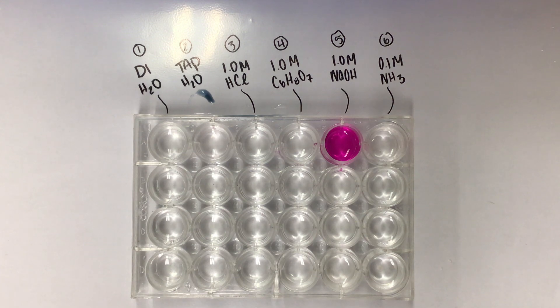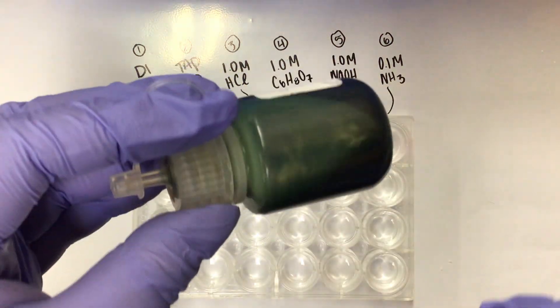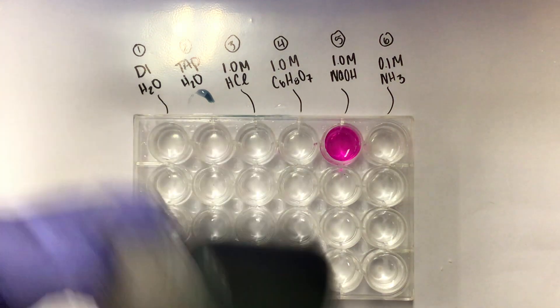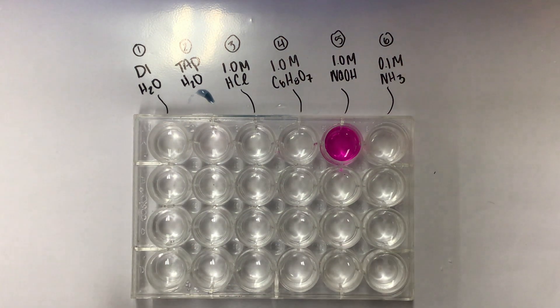Next test, moving on to well two. This time we're going to do universal indicator. Here's our universal indicator. It starts out as this bluish green color. I am also going to grab a universal indicator pH scale.